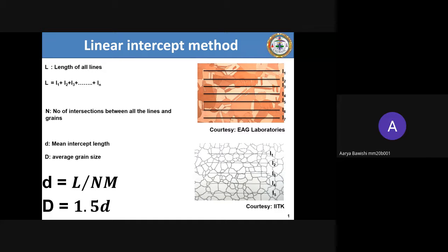Okay, all the students please take note. You don't have to divide by the magnification if you set the scale initially. Because if you set the scale bar, you don't have to divide by the magnification. That's the reason you got such a low answer. Otherwise, I think you would have got around 30 point something. Sir, I'm getting 3.09 micrometers.